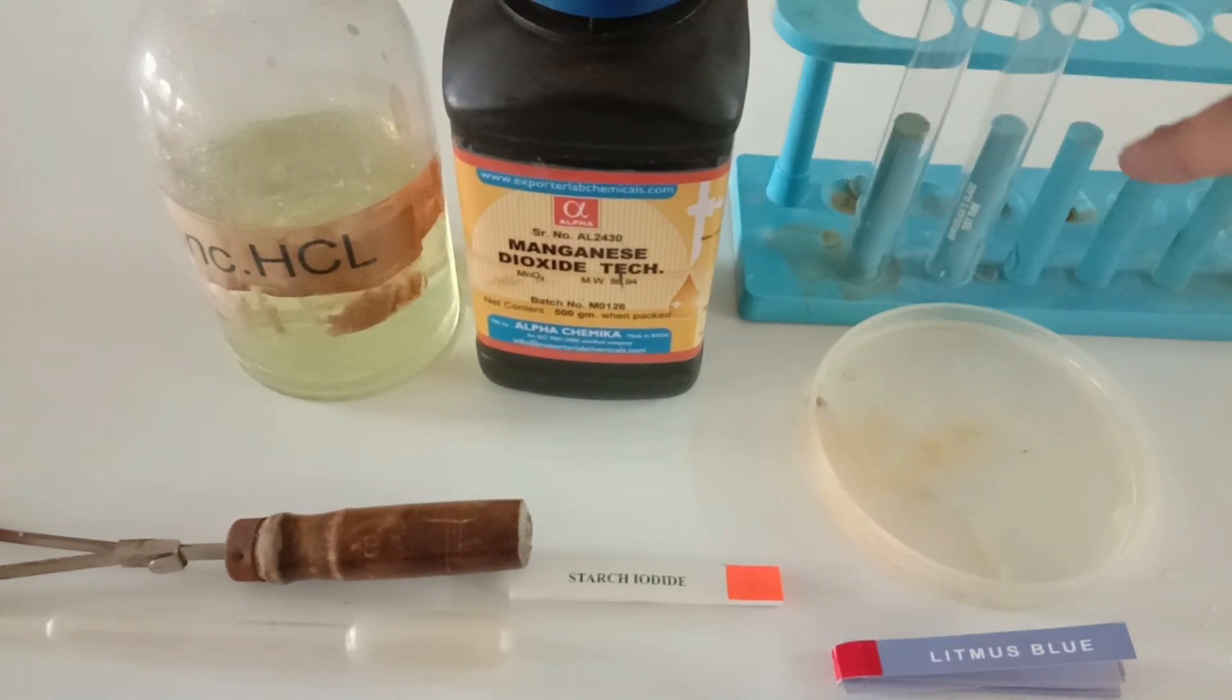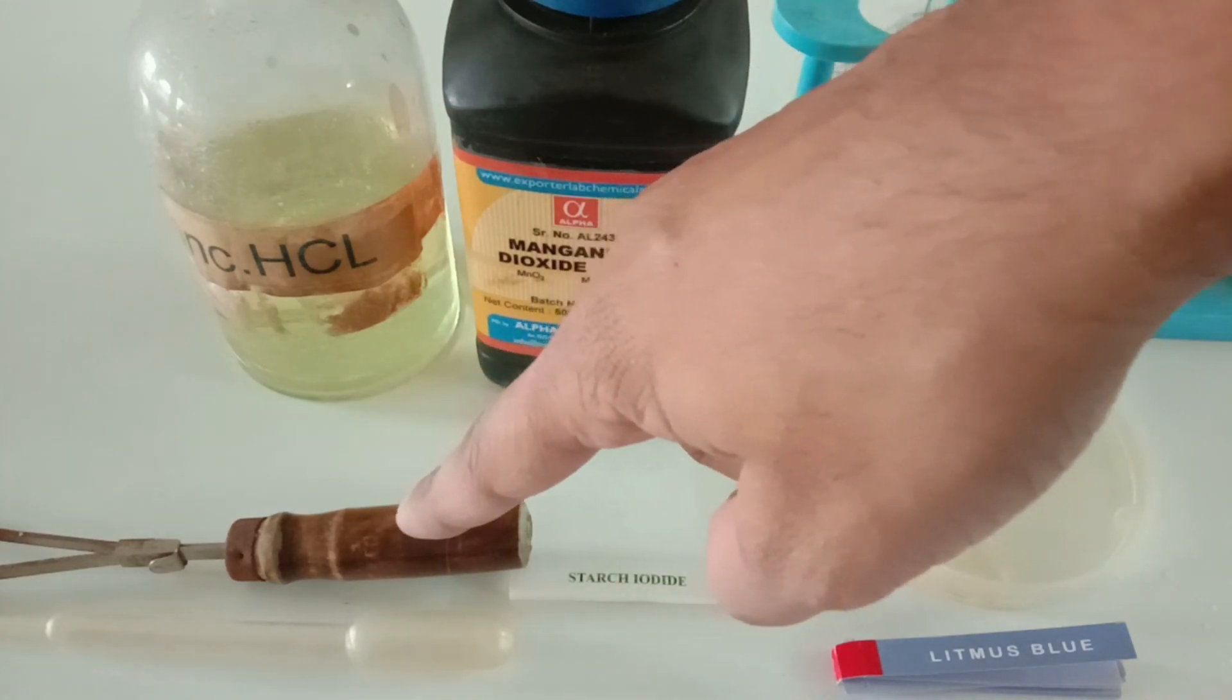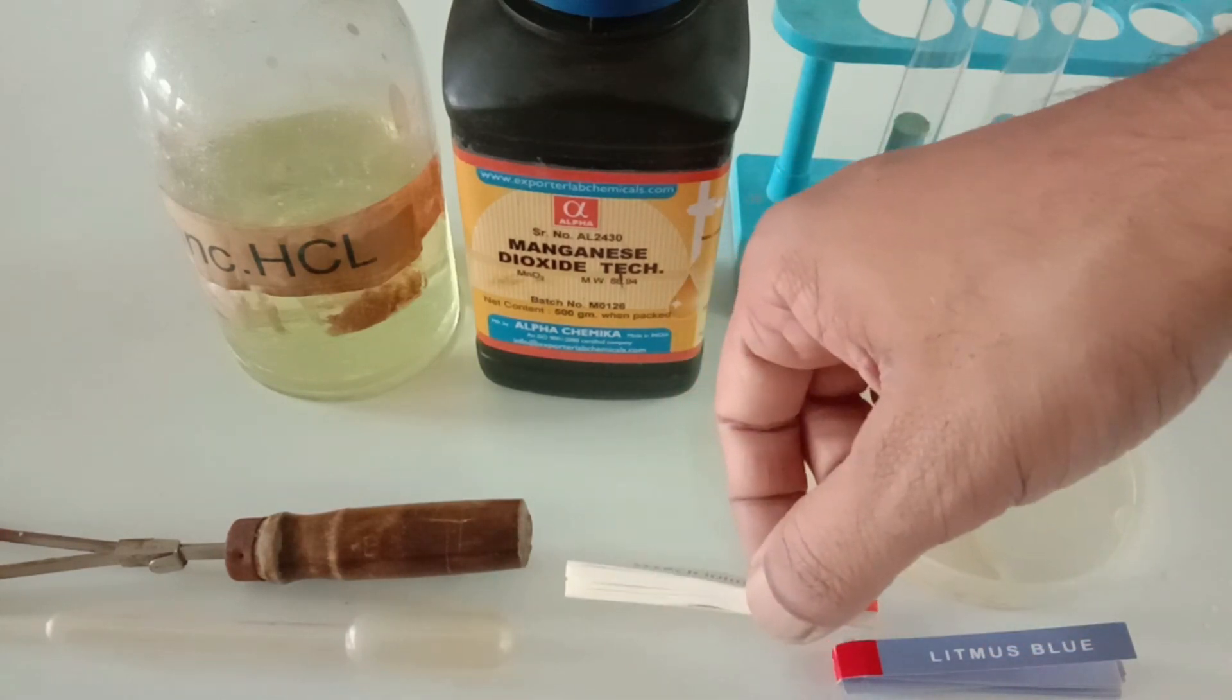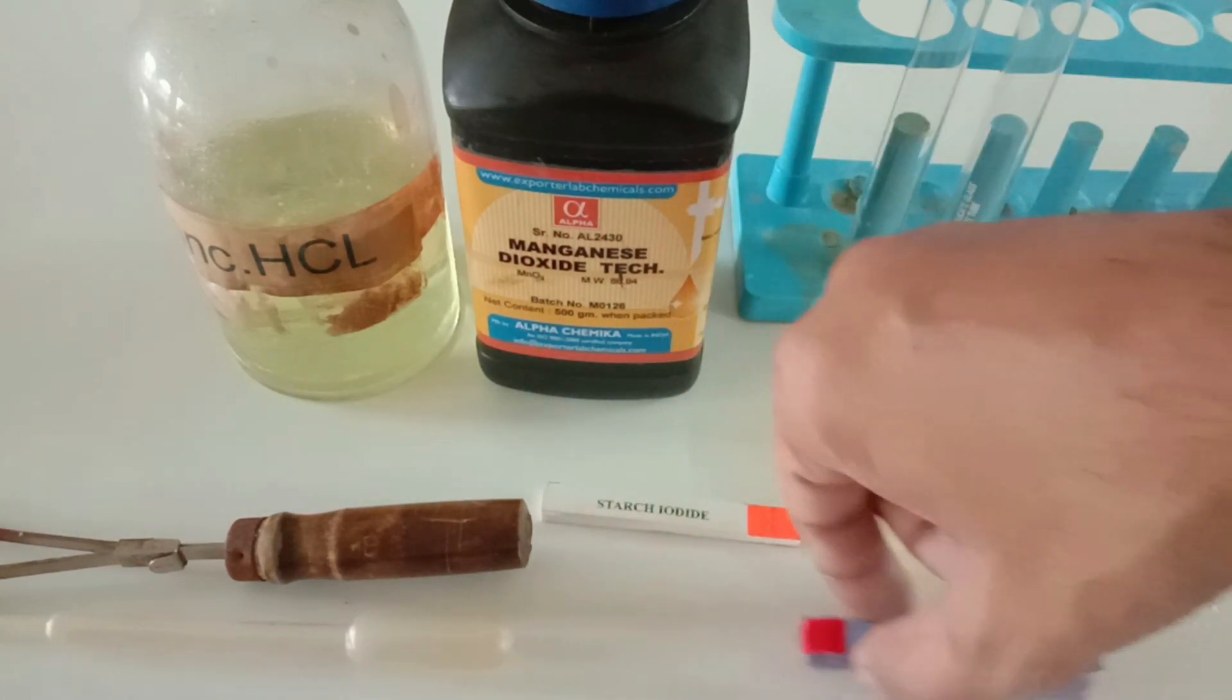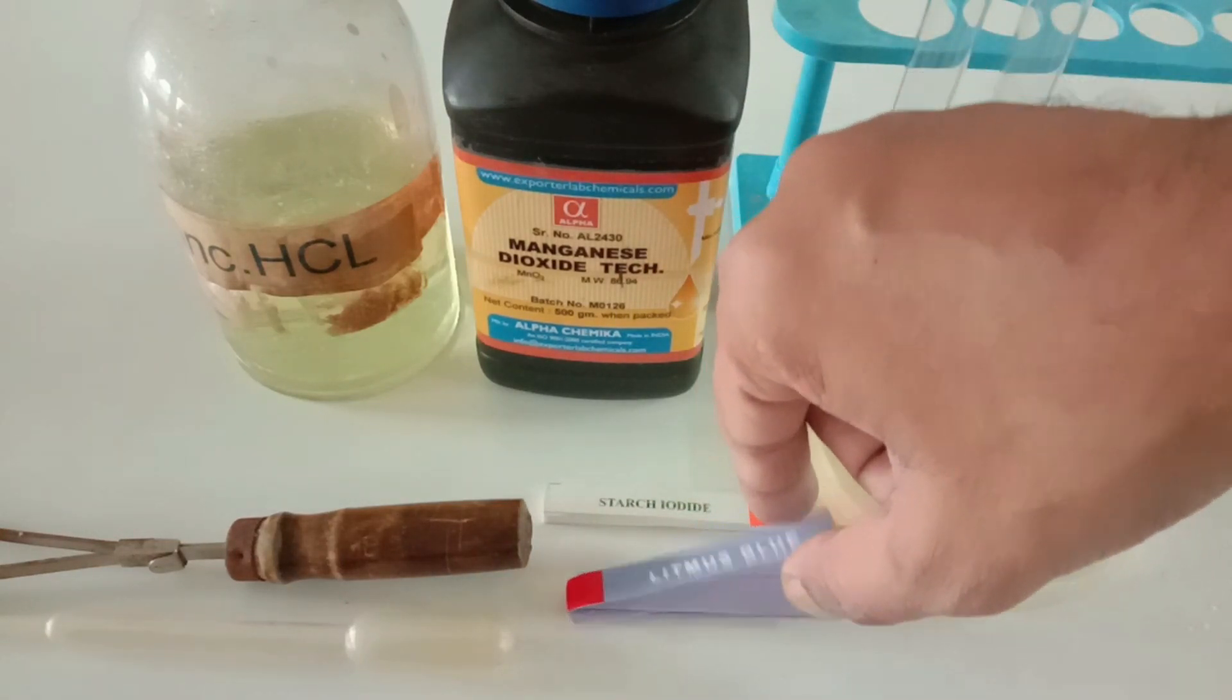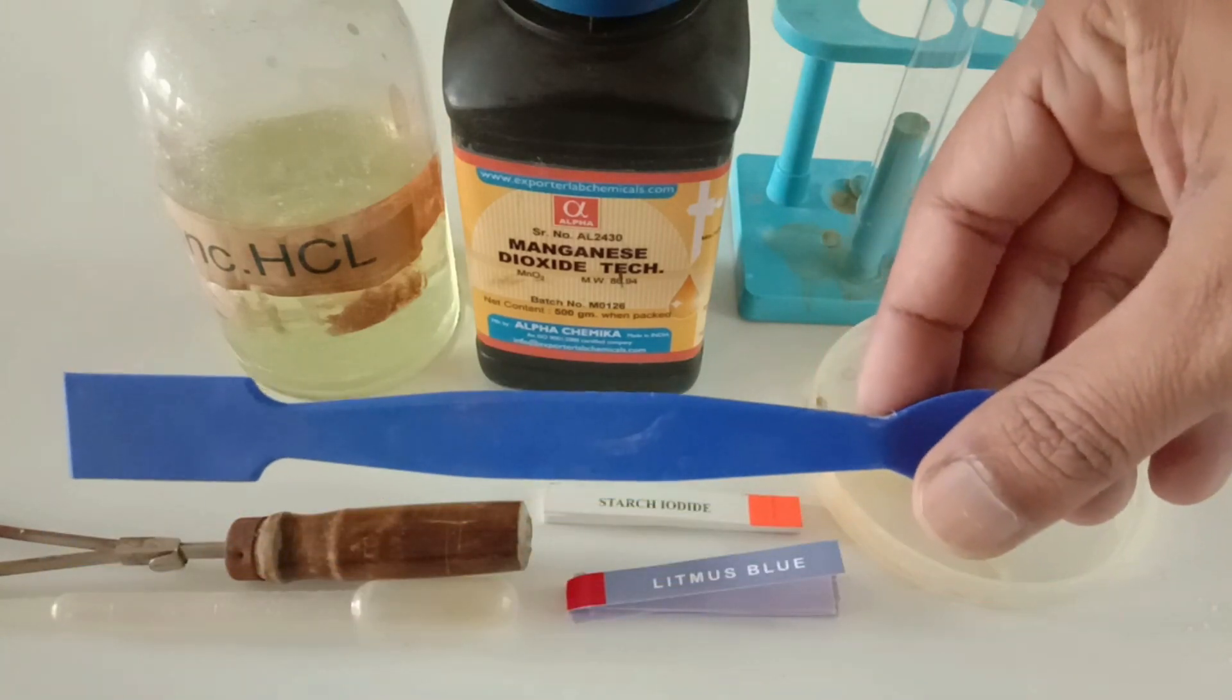Test tubes, test tube stand, some amount of distilled water in the petri dish. Make sure that you are not using tap water for this experiment. Test tube holder, white colored starch iodide paper, blue litmus paper, dropper, and spatula.